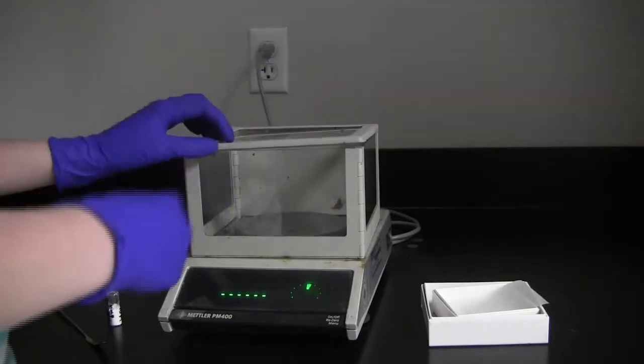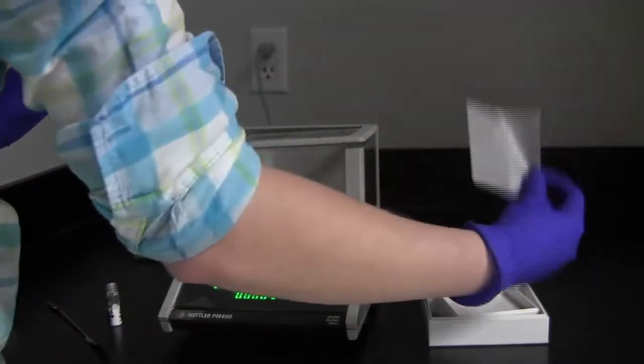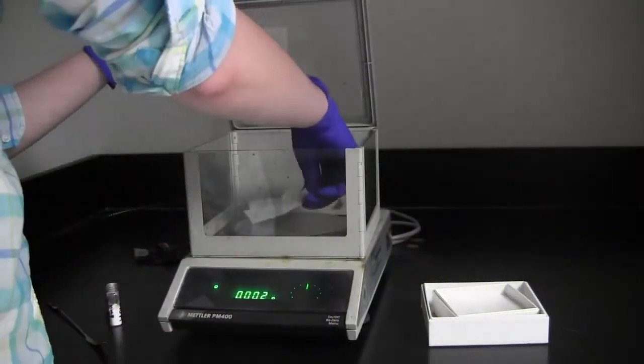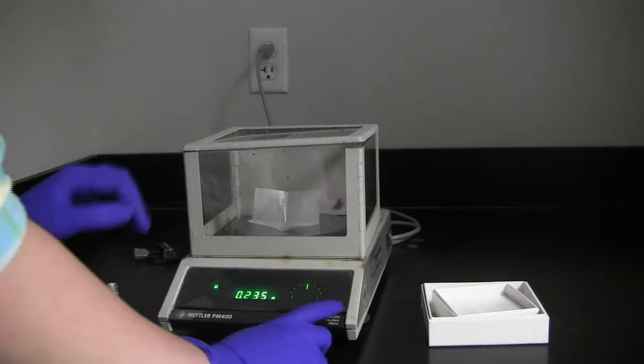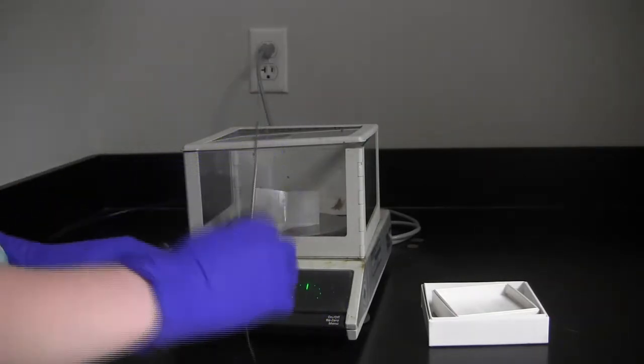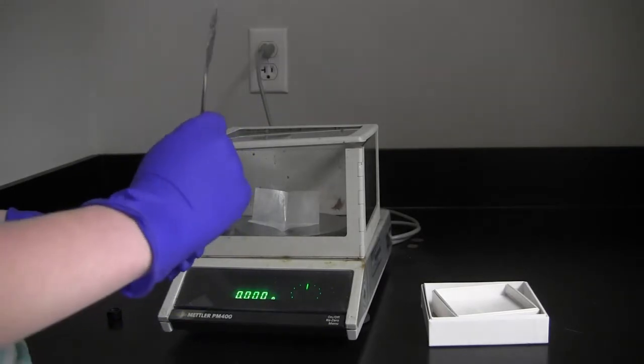Next, fold a piece of weighing paper into fourths. This will help when transferring your sample. Place the weighing paper on the scale and zero it by pressing the bar on the front. Make sure the LED screen says 0.00 grams, and then add your sample.